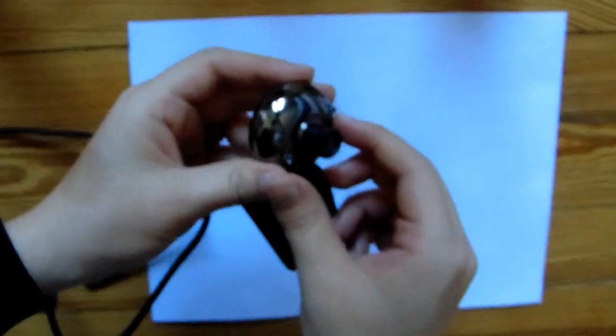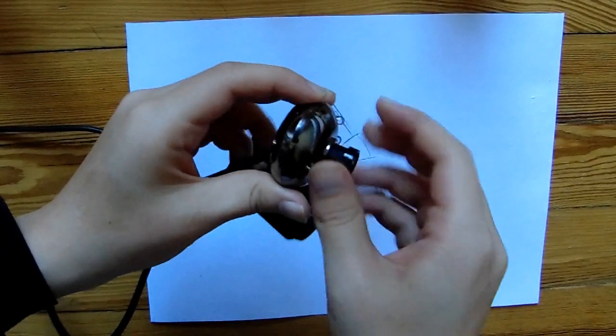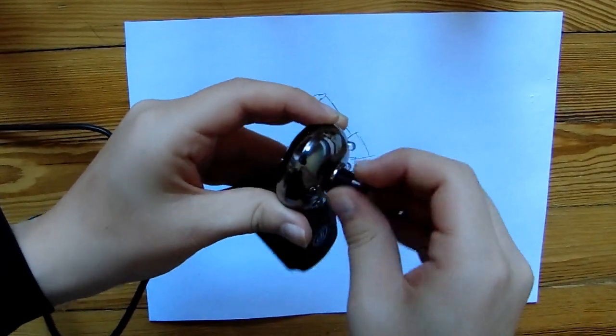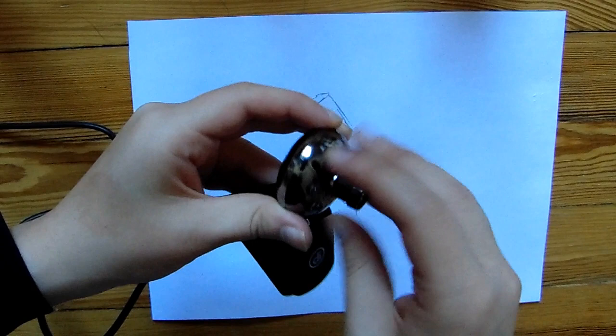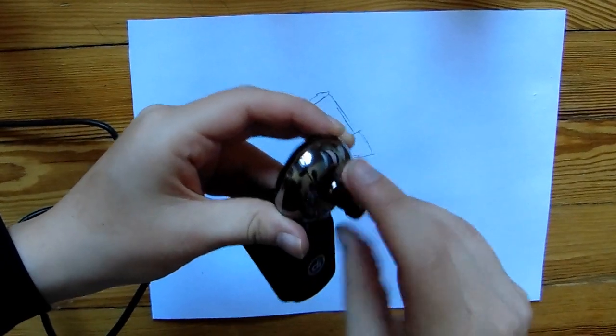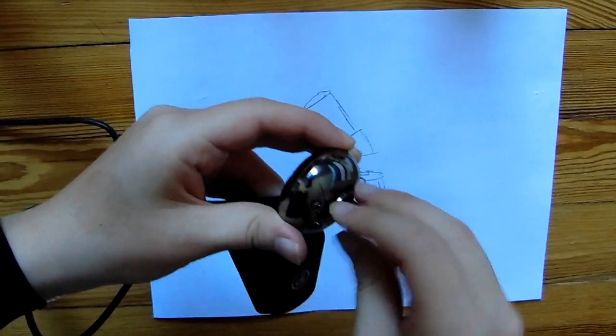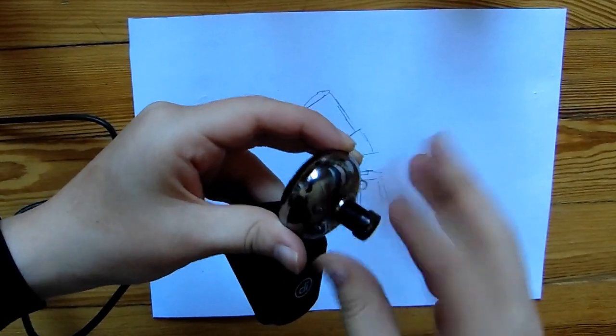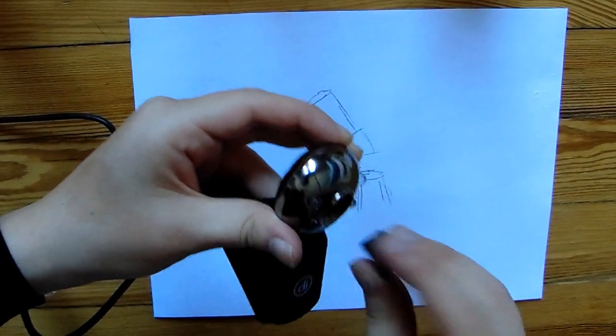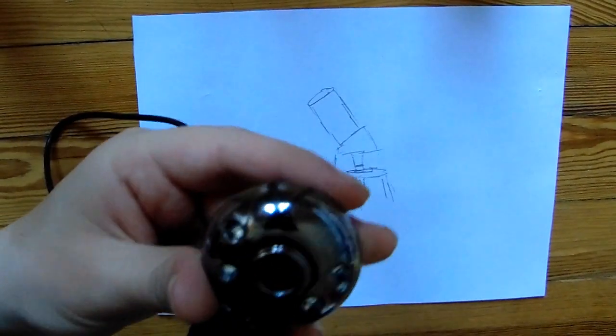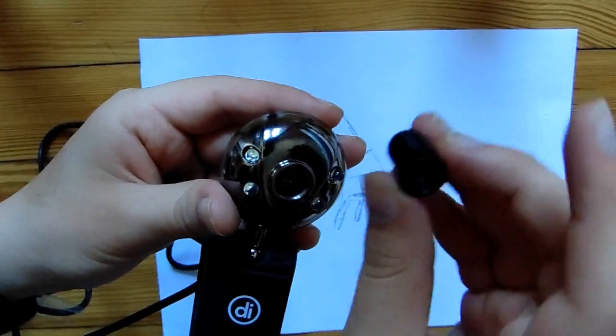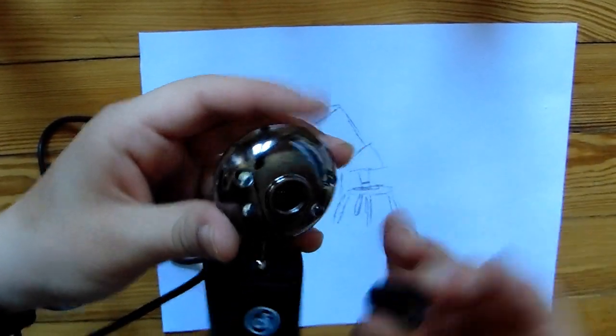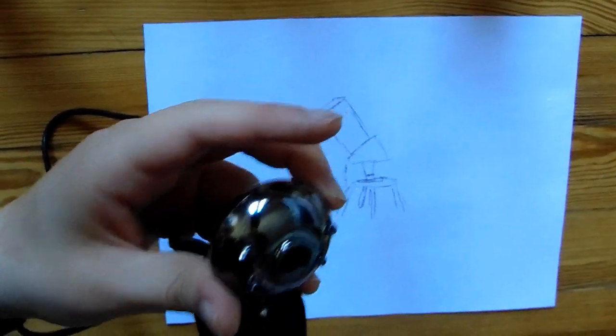So, behold! Lenses, and maybe a light detector. This is a webcam that I bought for $10, and we're going to turn this one into a microscope. This is just a DI chat cam. It was the cheapest one I could find with a manual focus. A different model would probably work just as well.